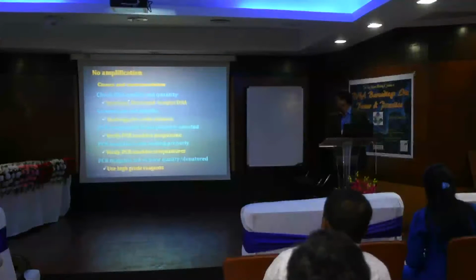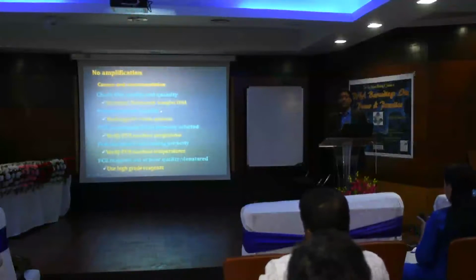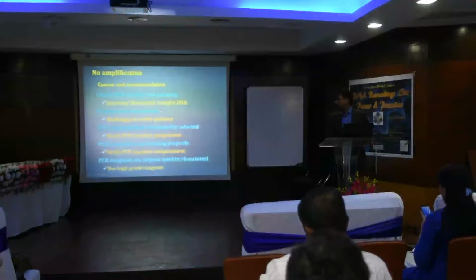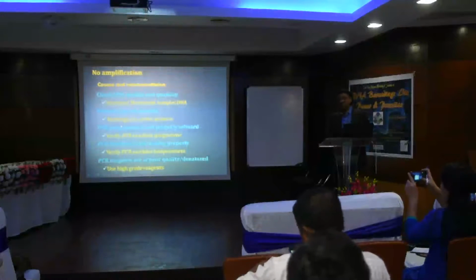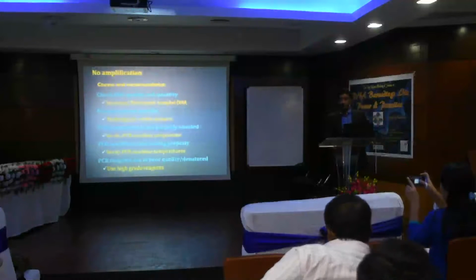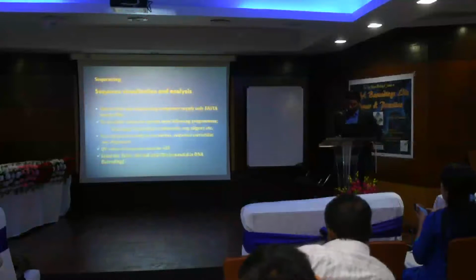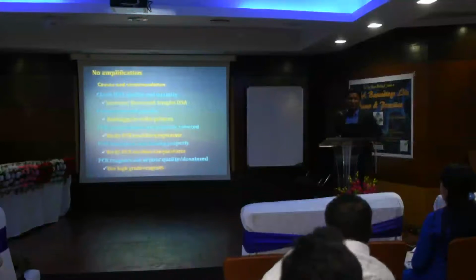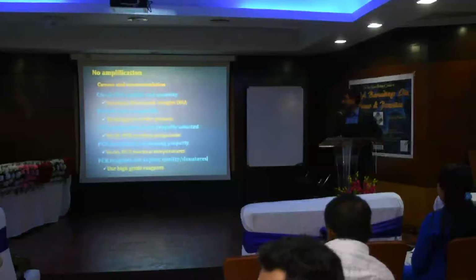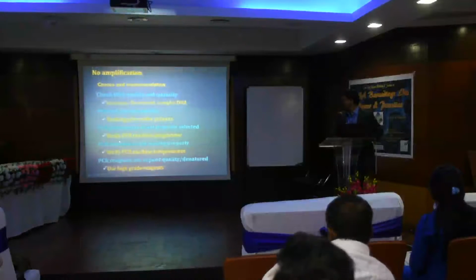you can check DNA quality, like decrease the template DNA if it is very high, or maybe there is very little DNA. Then primers are not specific, redesign them definitely. They don't have to do anything with your template. Then the PCR program is not properly played, like I was telling you. The PCR program is not good, so it will cause this problem. Then verify the PCR machine programs also in that case. Then the PCR machine is not working properly.